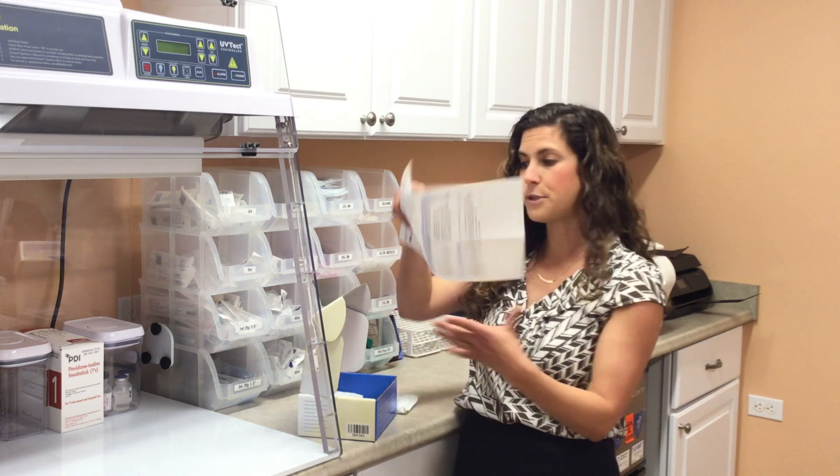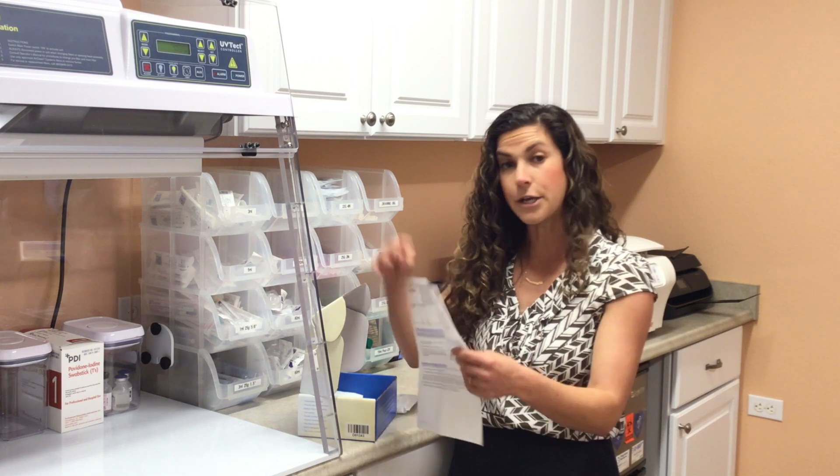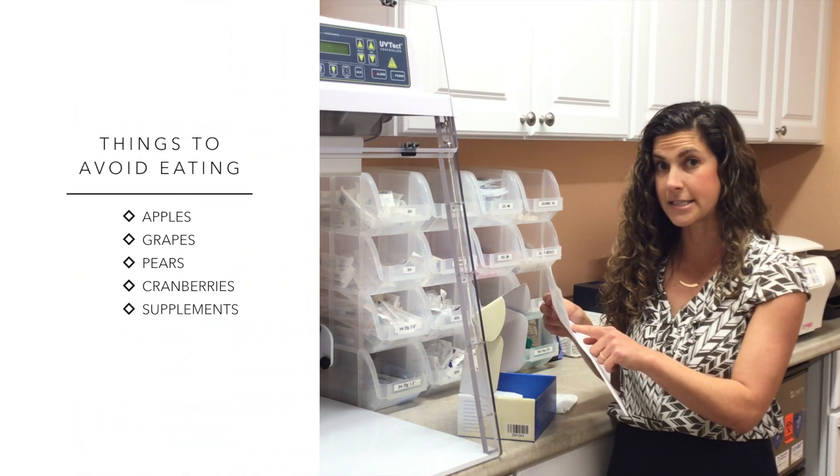The next thing you want to do is take out the requisition form that comes with it. We've highlighted the things that you need to fill out, but there's another thing that is very important: it says items to discontinue before collecting your sample.